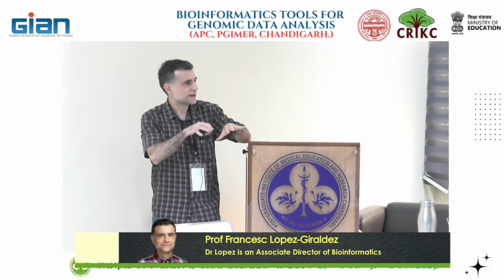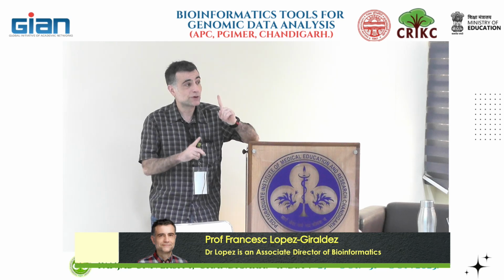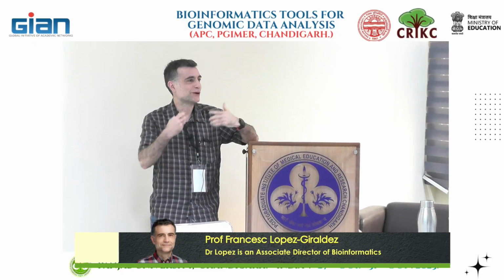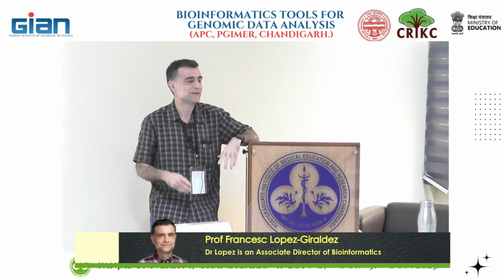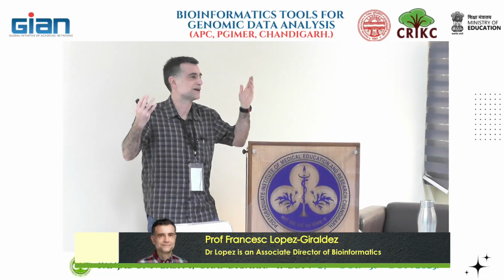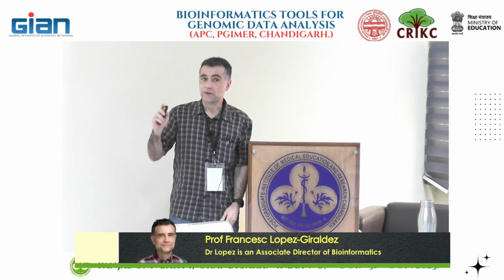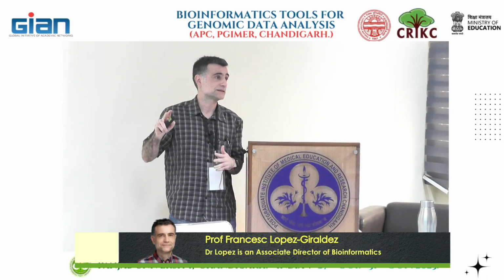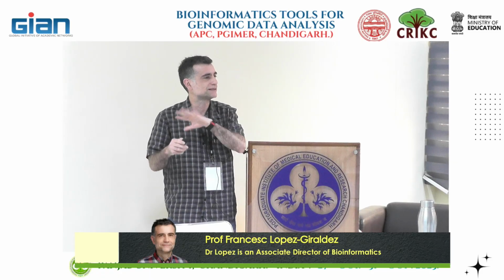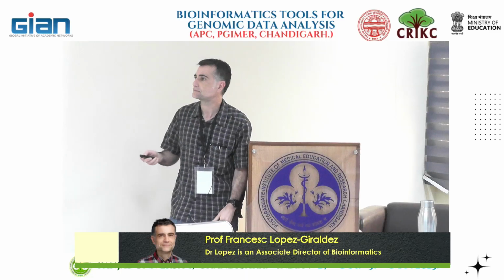So I started preparing the talk and I realized I only have one slide. There's only one main problem that I have with people who come to us to do NGS, and I'll tell you later what it is during the presentation. Then it evolves into: what are the experimental design considerations we need to have when we do an NGS experiment? The focus is going to be transcriptomics. Whatever I'm talking about here is going to be about bulk RNA-seq, but you can probably extrapolate a lot of things we talk about to any other type of sequencing.